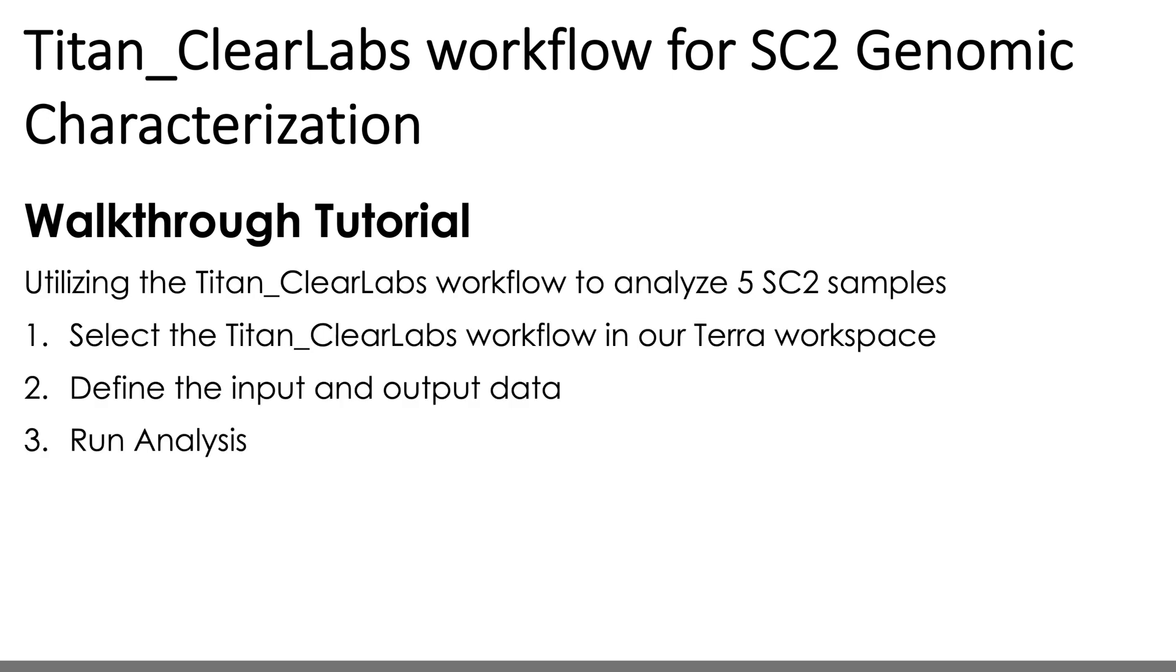But for any Titan workflow, or any Terra workflow really, there are three basic steps, and that's first, selecting the appropriate workflow in your Terra workspace. In our case, this will be the Titan Clear Labs workflow. Then we'll be defining both the inputs and outputs for the workflow, and then we'll be just running the analysis. All right, so let's get into it.